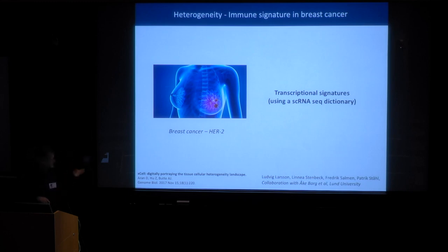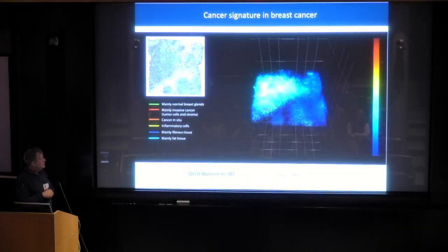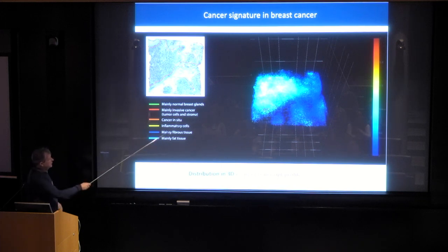And this is on bioRxiv. And I'm just going to give some glimpse of this. Again, this is the H&E stain of a tumor. This is invasive cancer. The dimensions here are 5 by 5 millimeters. And we look for a cancer profile.